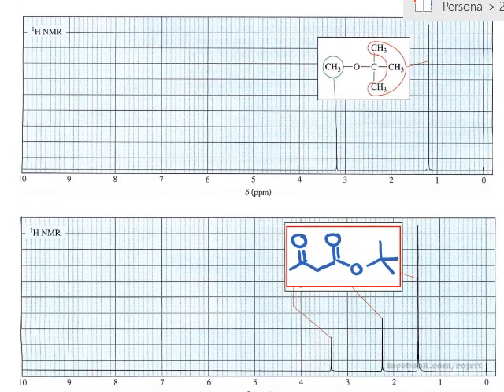Now, come to this one. As you can see, we have 3 different types of hydrogen atom. First of all, we have red hydrogen, as I labeled over here, and then we have purple hydrogen atom, and again we have green hydrogen atom.